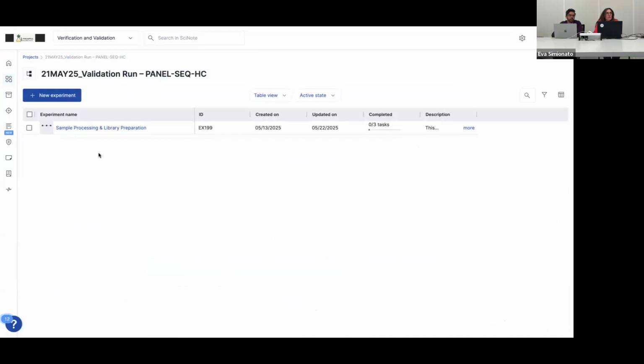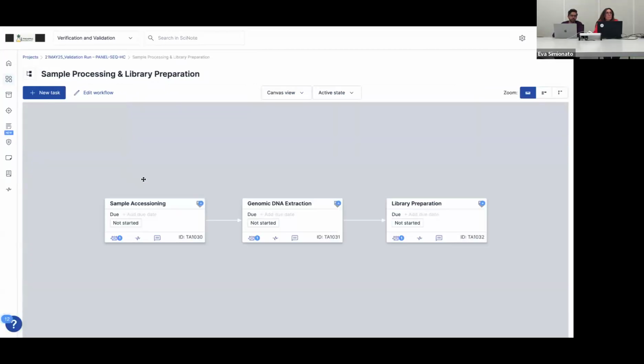And once this particular project is complete, you can generate a report for this entire workflow. It would contain all the information that we at some point discussed today. So we'd have the name of the experiments, name of the protocol steps, what items were used in each protocol, how much of those items were used in each protocol, where we placed them if we assigned a location, which items they're related to in what capacity, since we established the relationships for new items that we created. We created some items, marked them as outputs, and we basically closed out this workflow here.